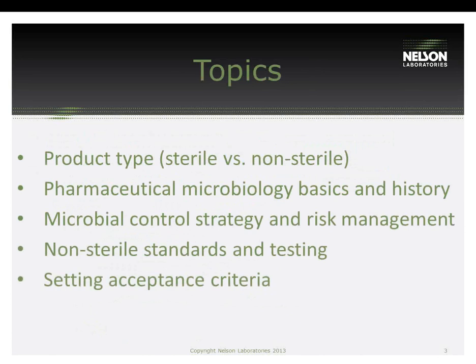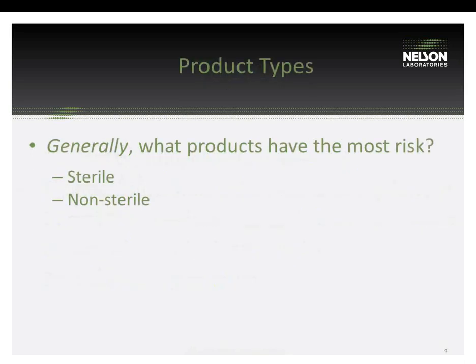Today I'm going to be covering product type, sterile versus non-sterile products, a bit about pharmaceutical microbiology basics and history, microbial control strategy and risk management, non-sterile standards and testing, and setting acceptance criteria for non-sterile products.